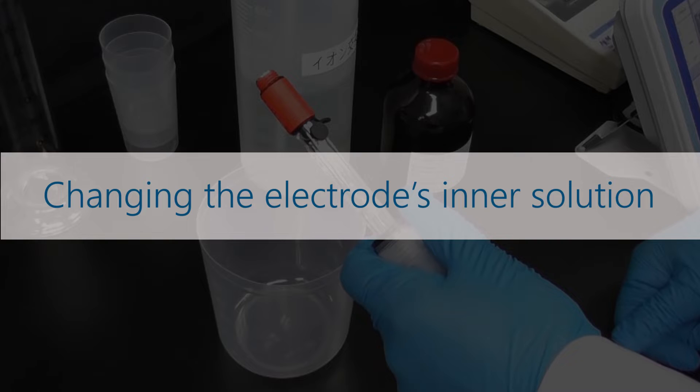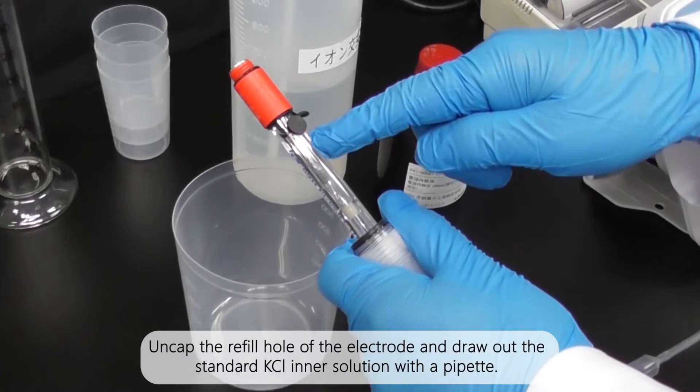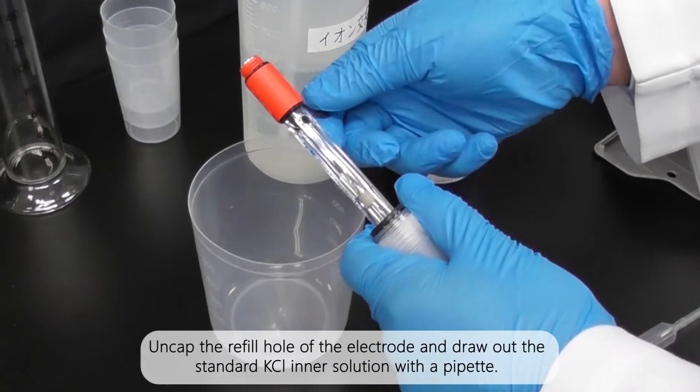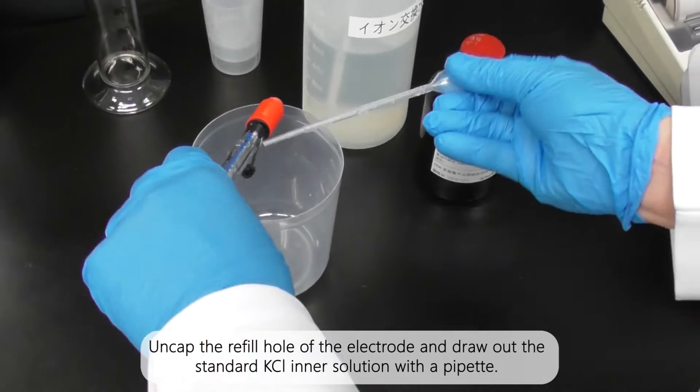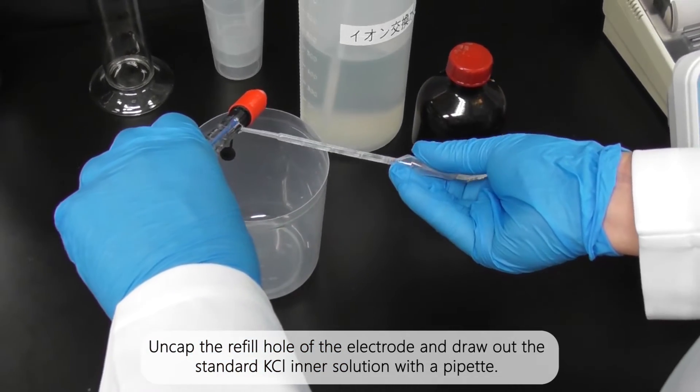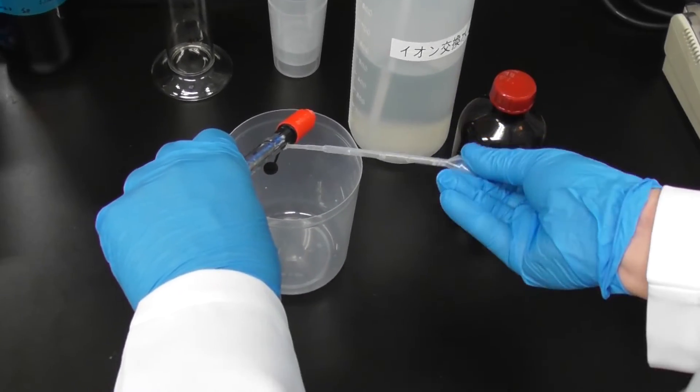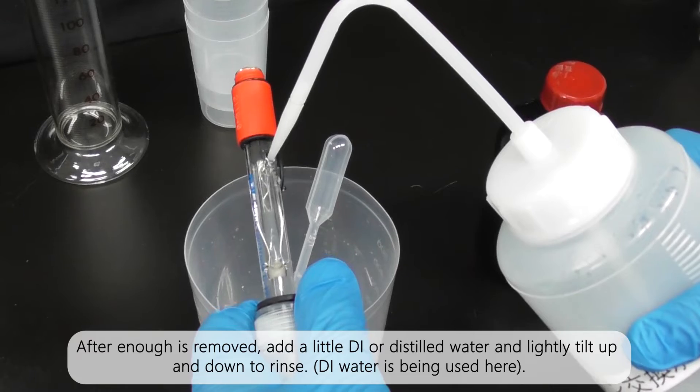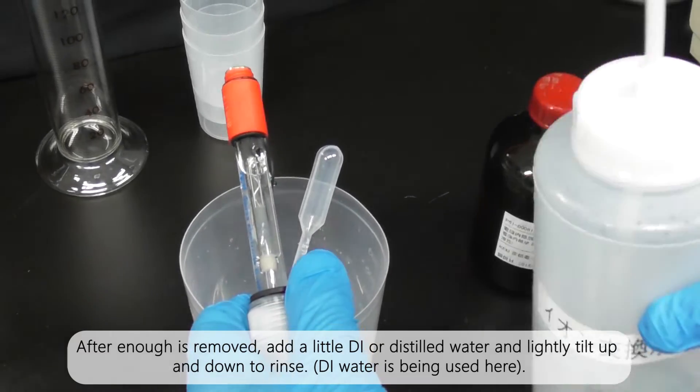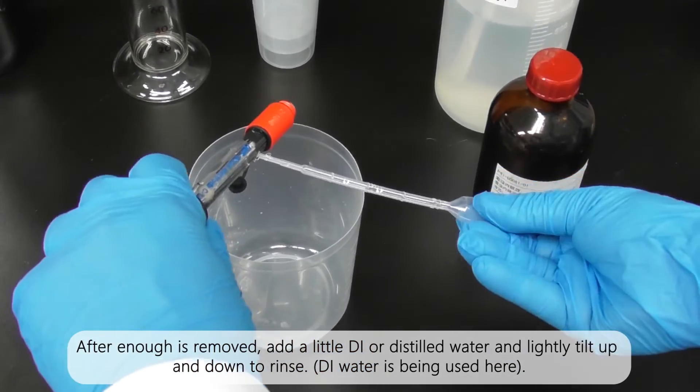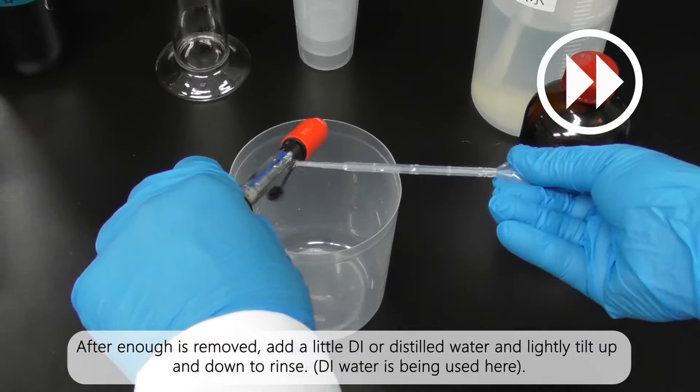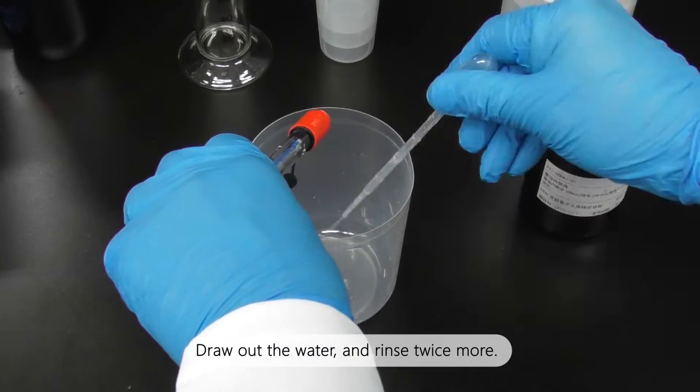Changing the electrode's inner solution: Uncap the refill hole of the electrode and draw out the standard potassium chloride inner solution with a pipette. After enough is removed, add a little DI or distilled water and lightly tilt up and down to rinse. Draw out the water and rinse twice more.